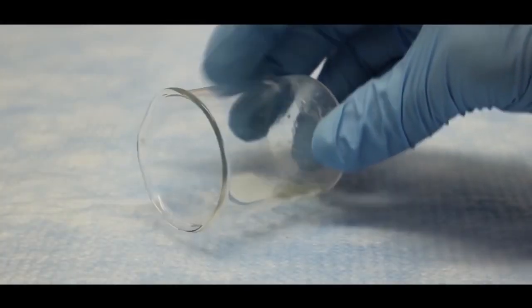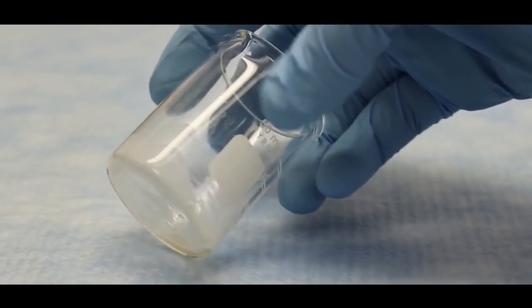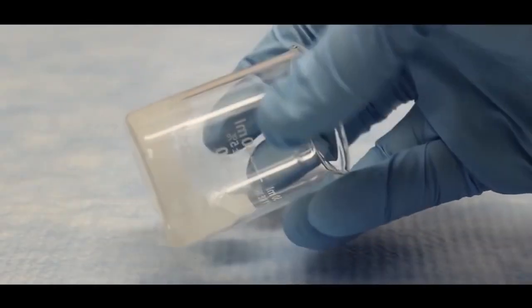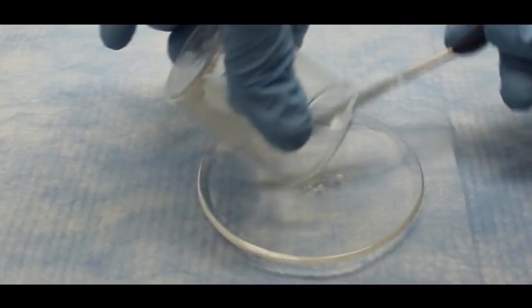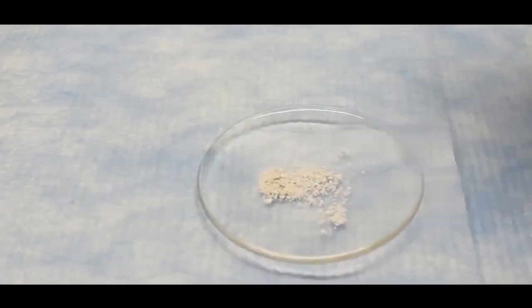I will also let the very last of it evaporate on its own at room temperature and increase its surface area by rolling it around a few times in a beaker. I can then scrape it from the beaker to a watch glass, and when it's completely dry, record its mass.